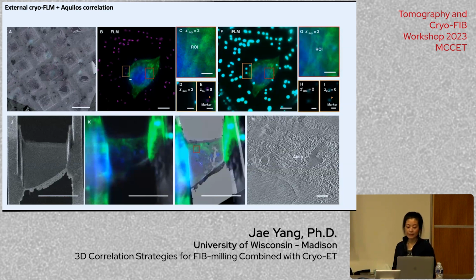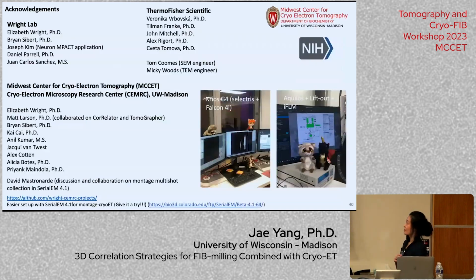I probably should have intervened a little bit because it ended up very thin. And because it's so thin, during the loading, the transferring, the lamella actually broke. So you can see that the lamella is broken, but the fluorescent channel images are there. However, this method does have a limitation, because your fiducial needs to be very close to your ROI, because the deformation of your sample during the handling and during the imaging cannot be accounted for by the external fluorescence which you collected before. So this is the limitation.